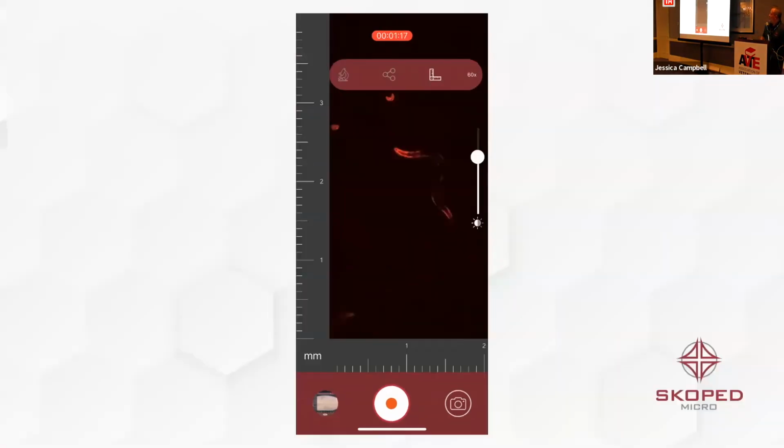So again, here's showing our scale again with this off. These are actually fluorescent worms. I had a meeting with the University of Alabama 6 weeks ago where we're using this app and the microscope adapter in some research for dementia research. And these fluorescent worms, the camera systems didn't like the fluorescence. When I first got the meeting with them, they said, wow, can your system work with fluorescence? And I said, yes. And I prayed that it would. And showed up in Tuscaloosa sweating. Luckily, it was a hot day, so they thought it was because of the heat.